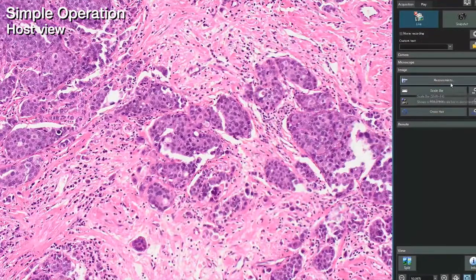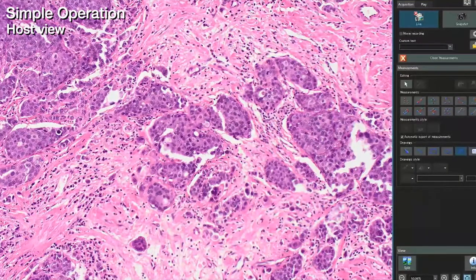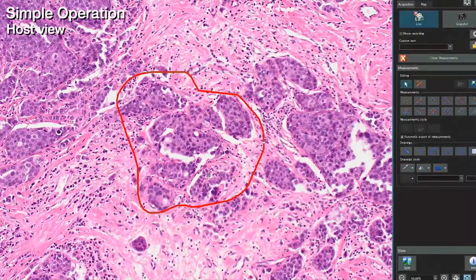The host can choose to show live or saved images. You can also display a control pointer to draw a region of interest or an arrow, and zoom in and out, enabling interactive communication.